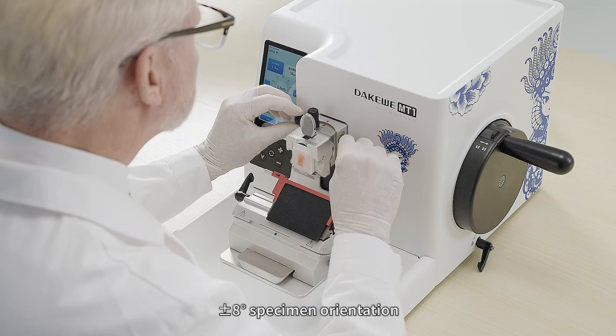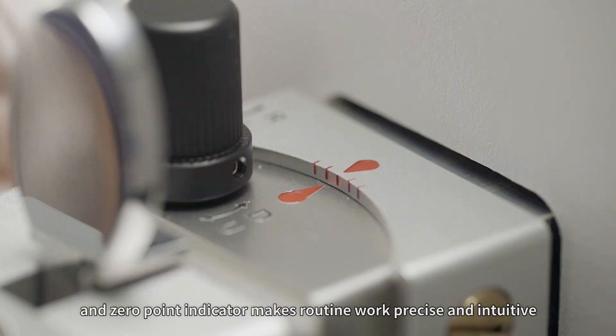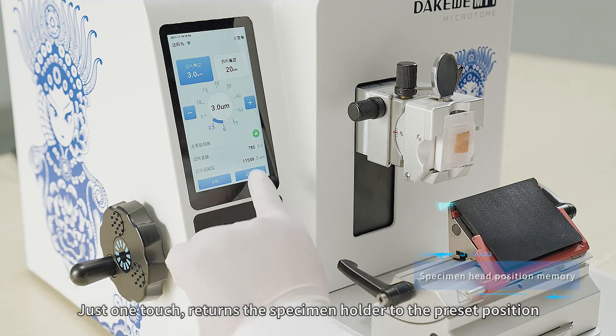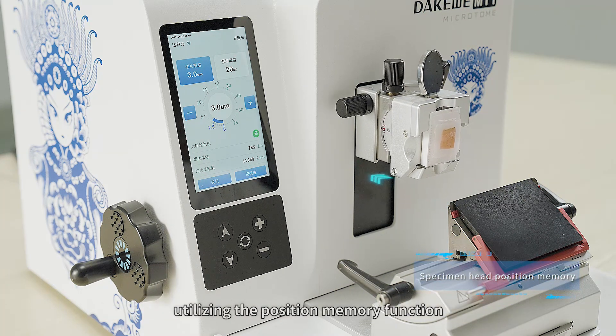Plus-minus-eight degrees specimen orientation and a zero-point indicator make routine work precise and intuitive. Just one touch returns the specimen holder to the preset position, utilizing the position memory function.